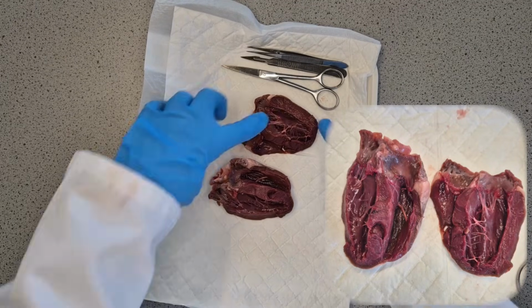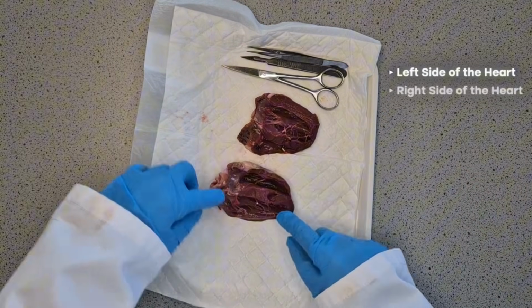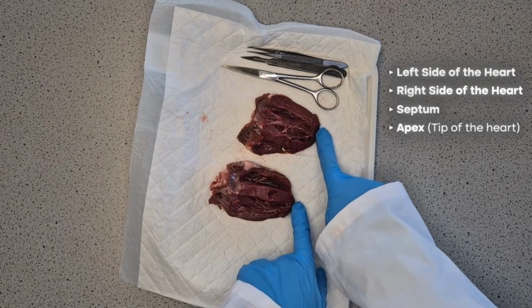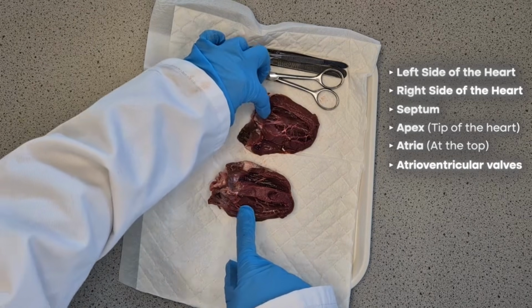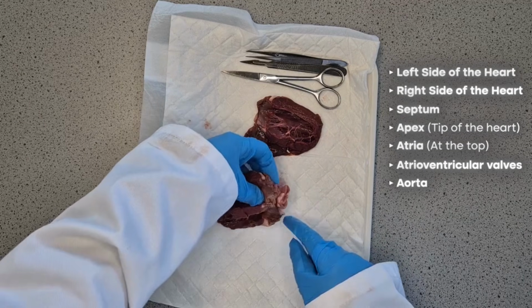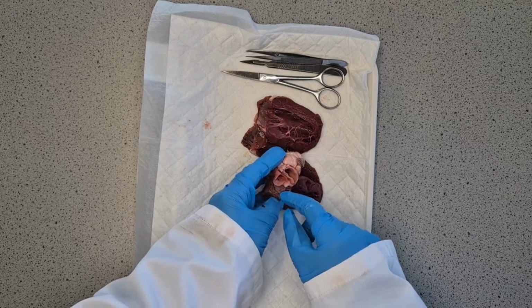We've got the left side of the heart. So this one, that is the left. You can tell it's got that thicker muscular wall. We've got the right side of the heart. We've got the septum. This is the apex, meaning the very tip of the heart. These were the atria at the top. We've got the atrioventricular valves, the tendons connecting to those, and on this section we can still see the aorta and the pulmonary artery. And again, the final way we can check we've definitely got those blood vessels the correct way, as well as the thickness.